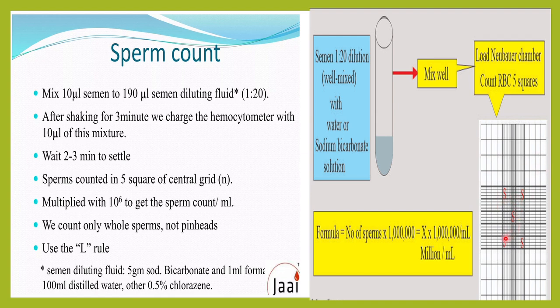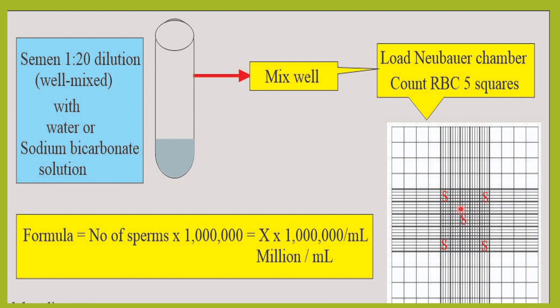We count the sperms in 5 grids — the RBC grid, the central grid. You can see here: 1, 2, 3, 4, 5. Whatever sperms you count in these 5 grids, you multiply by 1 million to get the number of sperms per ml of semen. We only count complete sperms — not just the head or just the tail. The complete sperm must be counted, following the L rule. The formula is: number of sperms counted multiplied by 1 million.